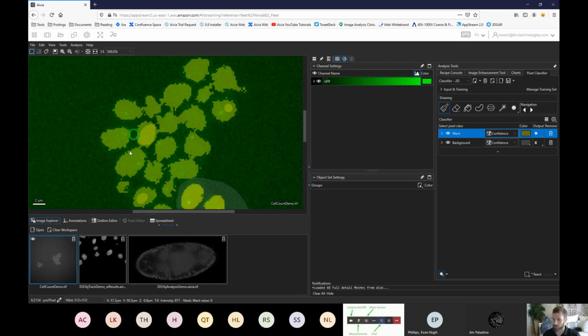With the pixel classifier, what I normally do is areas where I see these cells connected, like these little bridges you see here, I'll turn on the brush tool and select my background, make my mouse very small, and then paint those separations explicitly. And that usually clears it right up.